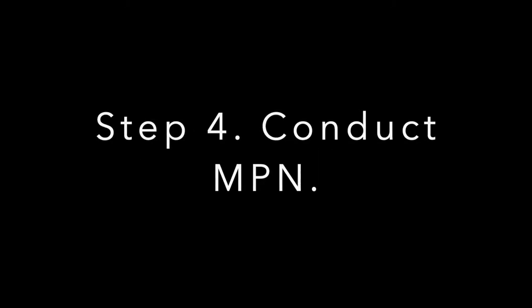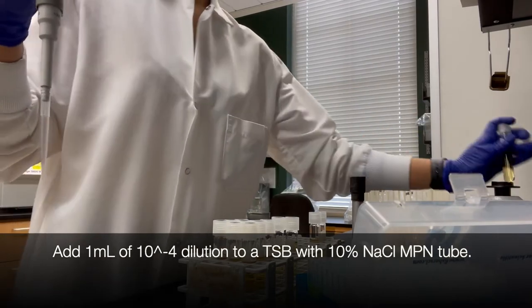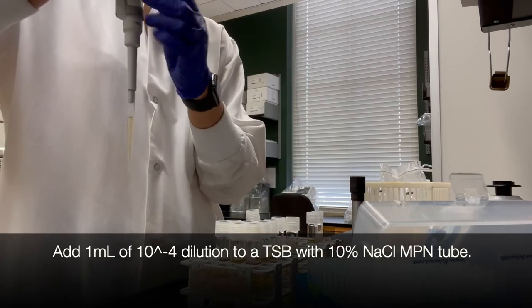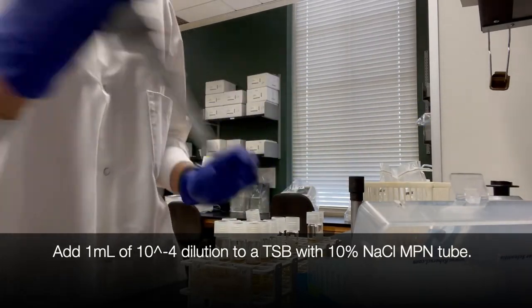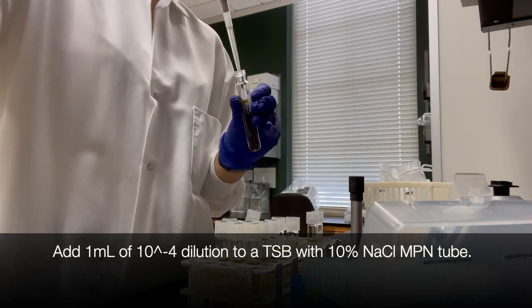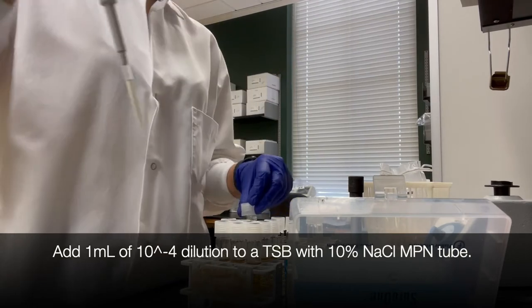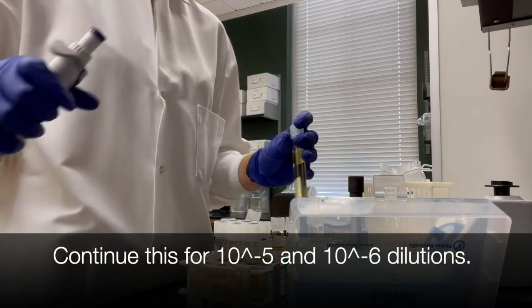Step 4 is to conduct your MPN method. Add 1 ml of the 10 to the minus 4 dilution to a TSB with 10% NaCl MPN tube. Continue this for the 10 to the minus 5 and 10 to the minus 6 dilutions.